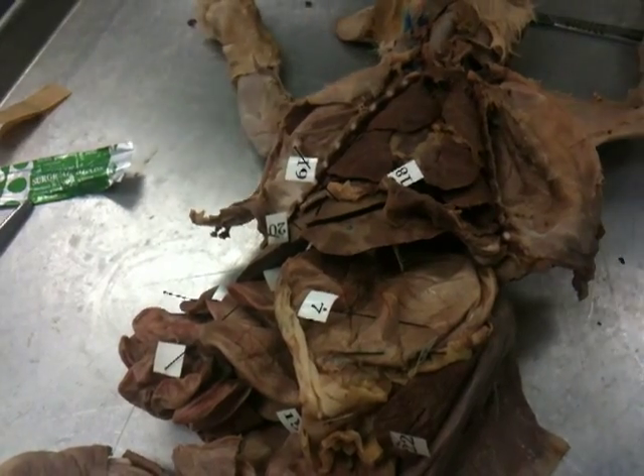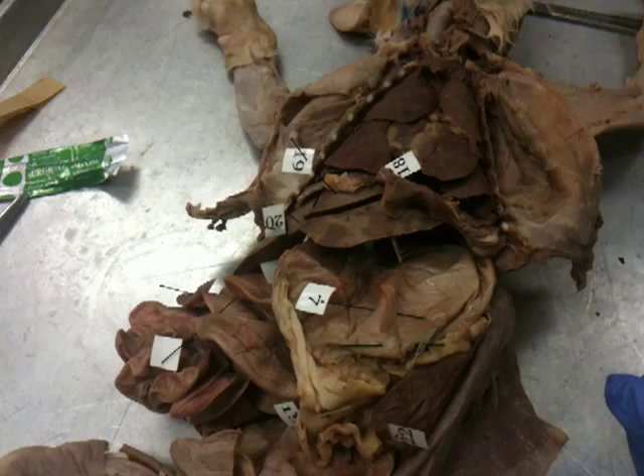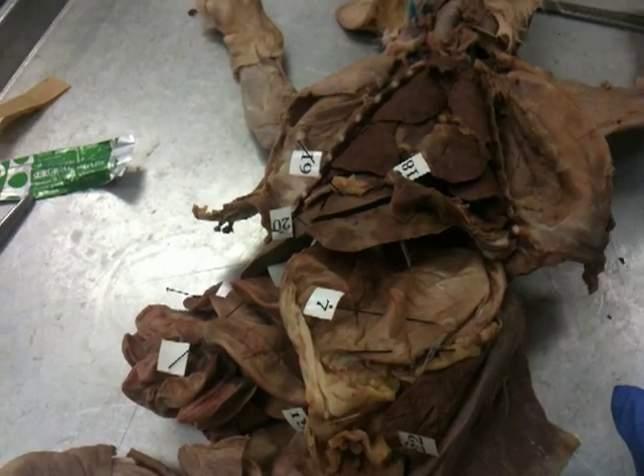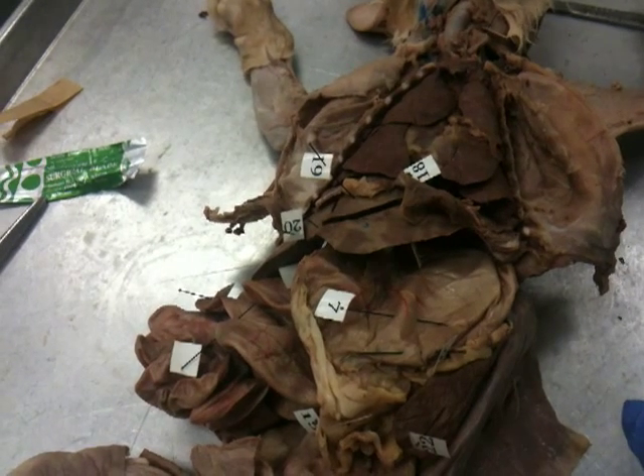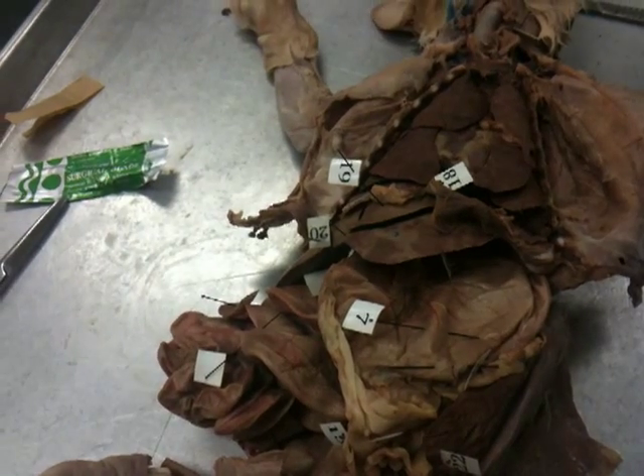You have to agree to unpin your cat tomorrow before you leave open lab. I have one pinned cat from my Monday-Wednesday class and this pinned cat, and I want them unpinned tomorrow so that if I want to use them on the exam they're ready. Otherwise they just can't stay pinned so long.